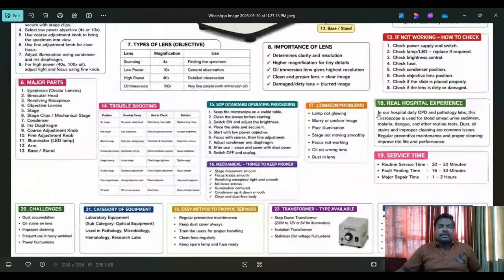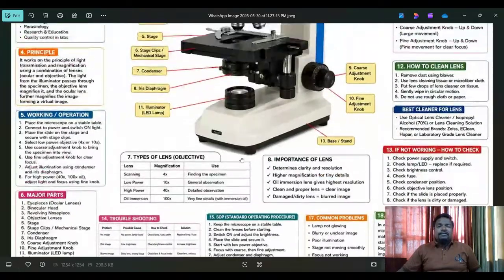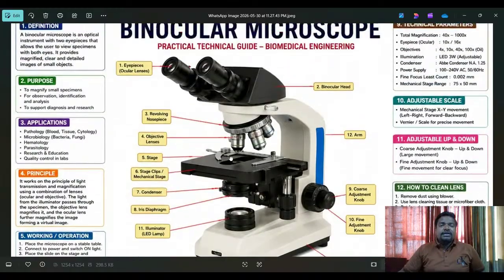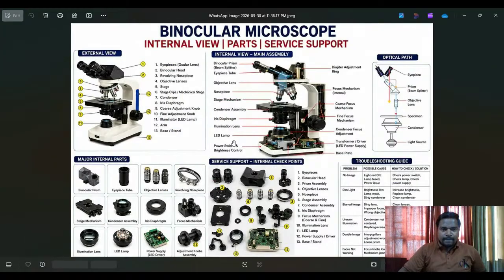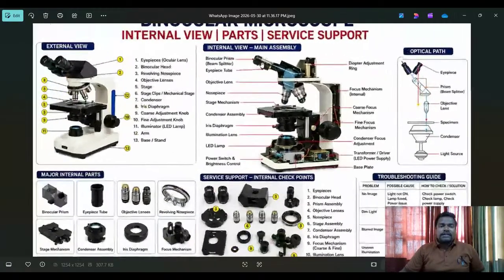So these are the things I have explained very clearly. I hope you got it. I am going to prepare complete notes on the microscope, in PPT form, and attach them in my live session so you can understand and download them. Okay. Next slide. So okay, this is the next slide. See here.